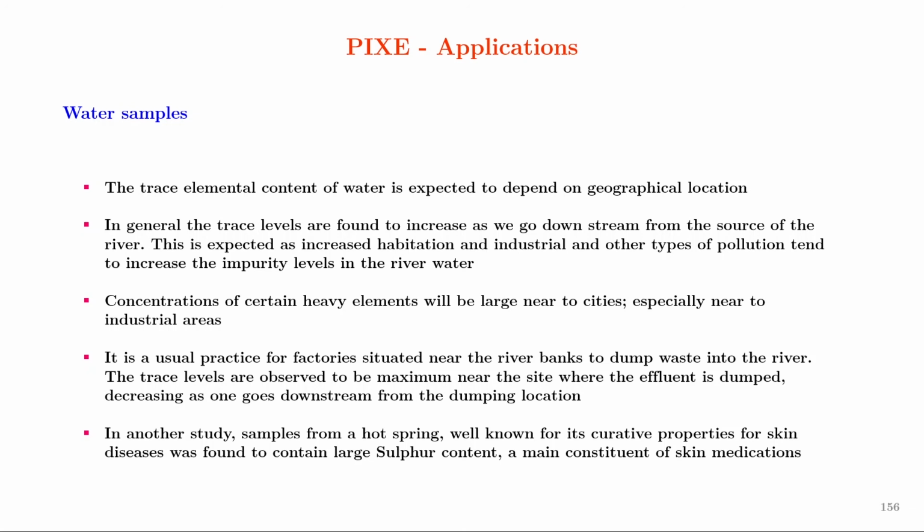In another study, samples from a hot spring, well known for its curative properties for skin diseases, were found to contain large sulfur content, a main constituent of skin medications.